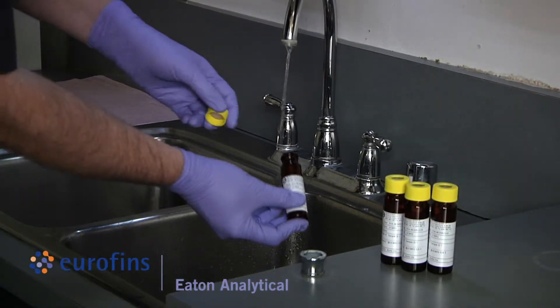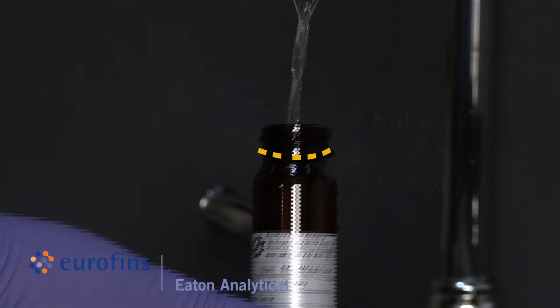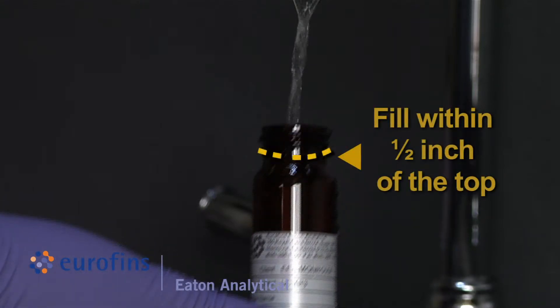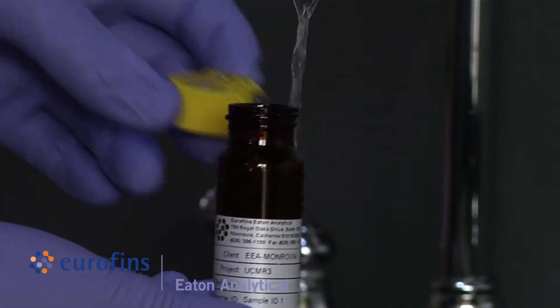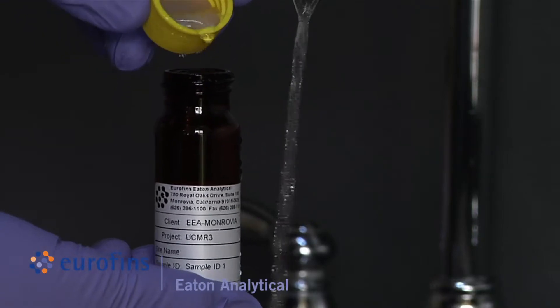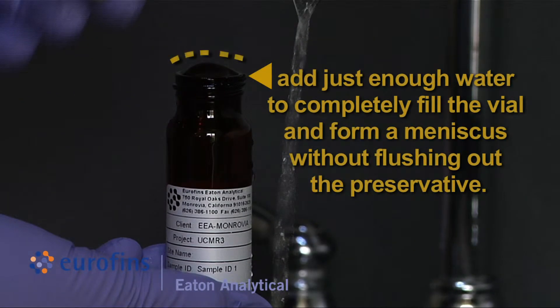Start sample collection by filling the vial to within half an inch of the top but not overflowing. Using the vial cap, add just enough water to completely fill the vial and form a meniscus without flushing out the preservative.